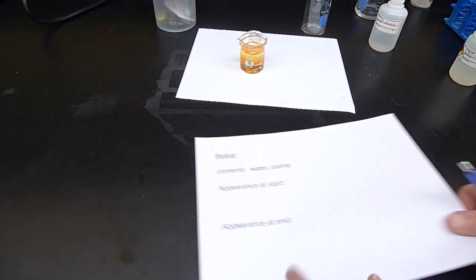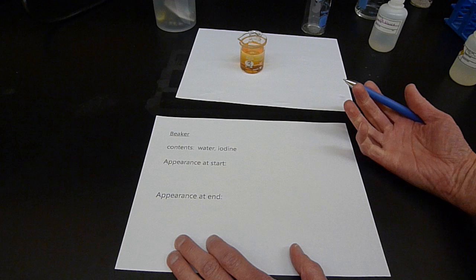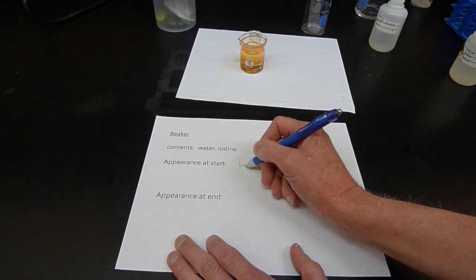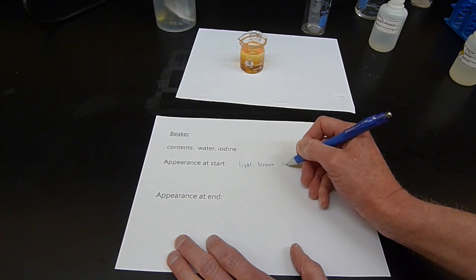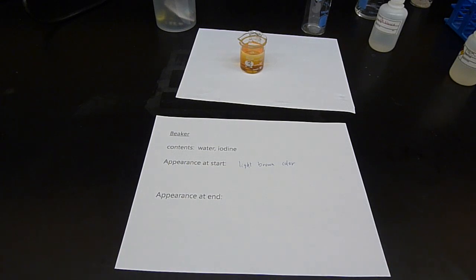We're also going to record what the water in the beaker looks like. Here is a place to record this. I'm just going to call it light brown color because that's the color from the iodine. And again, we're going to look at that color in about 15 minutes. We'll be back when things change.